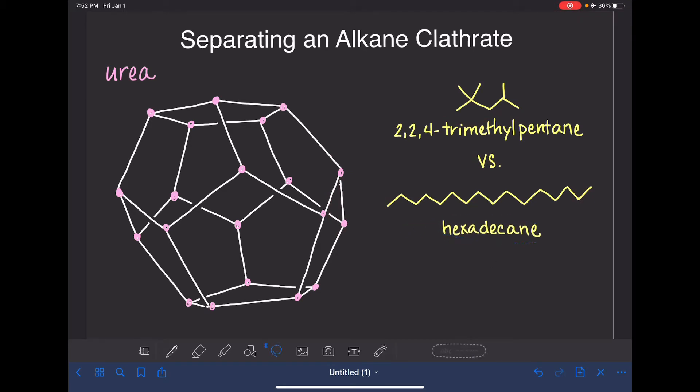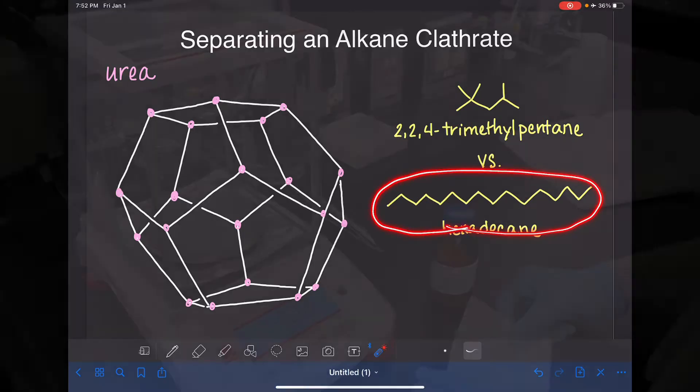As I said, in this experiment we're going to take these two different types of alkanes, we're going to mix them together in a combined solution, and then we're going to make the urea clathrate and we're going to see if the urea clathrate traps the 2,2,4-trimethylpentane or if it traps the hexadecane. Let's watch.